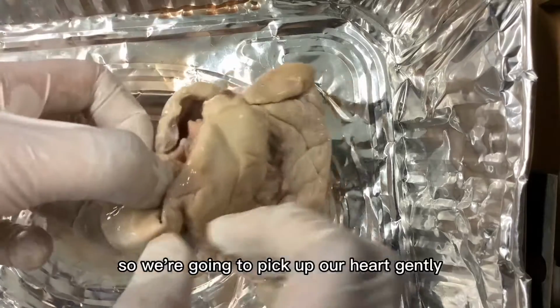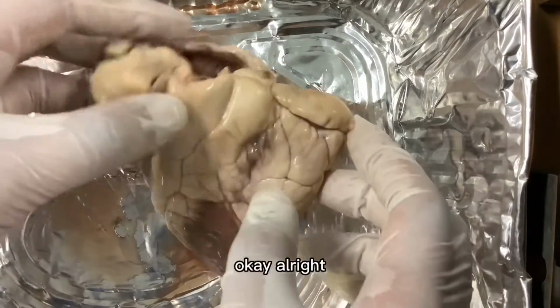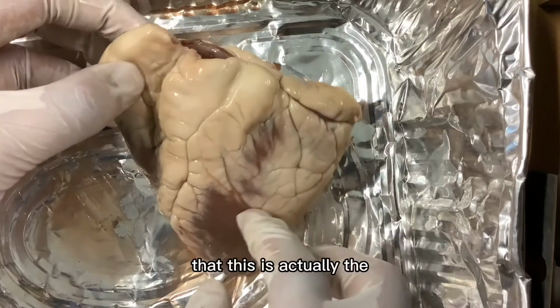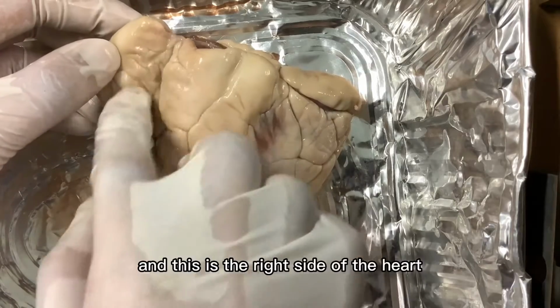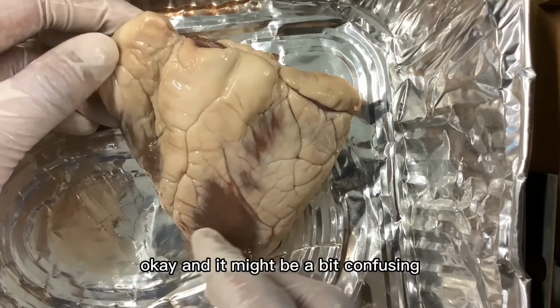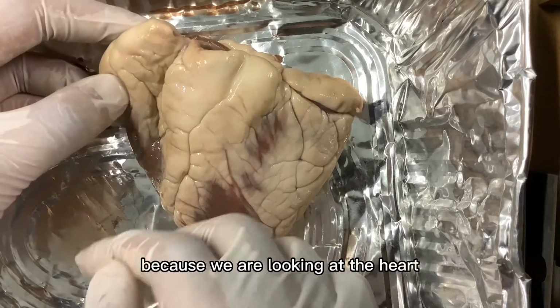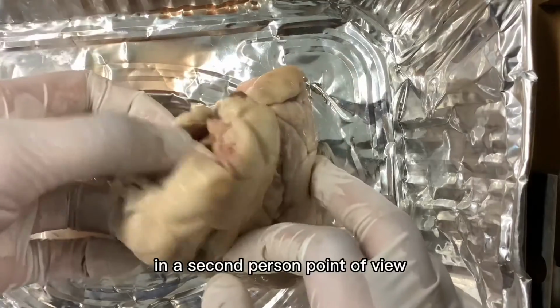We're going to pick up our heart gently and observe the top part of the heart. Before that, we should take note that this is the left side of the heart, and this is the right side of the heart. It might be a bit confusing, but that's how it is because we are looking at the heart from a second person point of view.